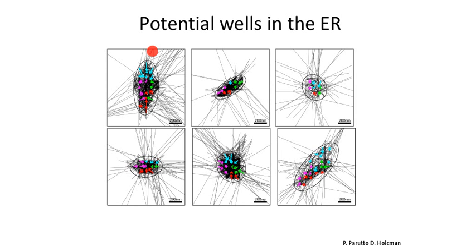Then we looked specifically at this region and estimated if there was a vector field, that is, if the reason why trajectories are confined is because there could be a potential force. So here we calculated a force by estimating again the difference of velocity between time t and time t plus delta t.